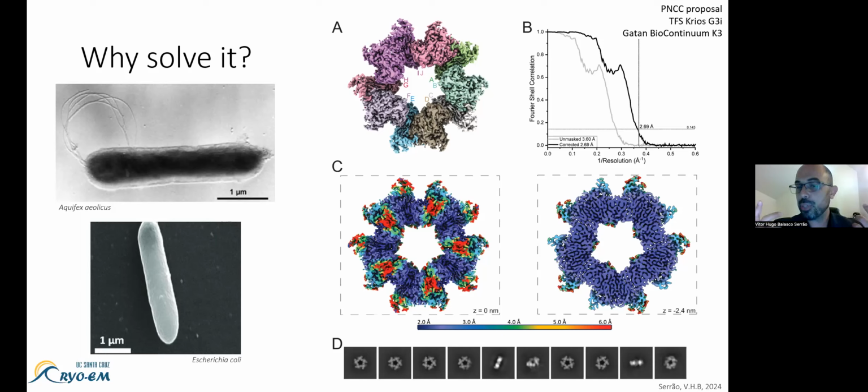As you can also appreciate, SelA has this particular donut or ring shape once you look from the top view, but on the side, it's really, really tricky to do the particle picking. So during the particle picking, you can do a ring-based picker to identify where the donut shape is, and then another type of picking to identify where the side views are, and then you can combine both of the data sets later on, right? So this is what I did to identify the two different sets of particles, combine them together, and get this beautiful structure.